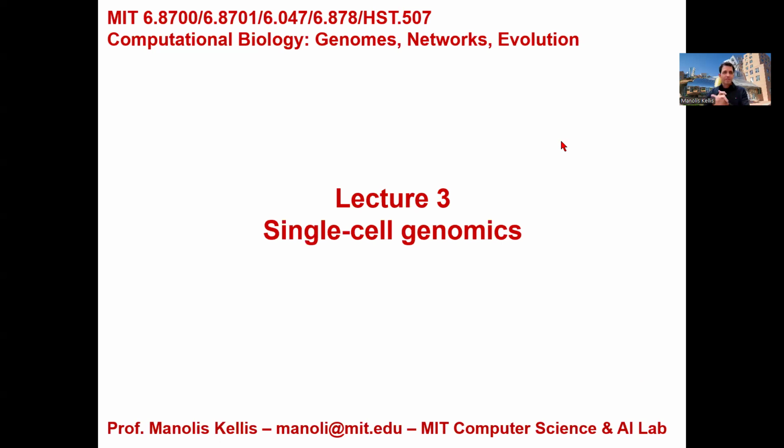All righty, welcome everyone. So today we're going to be talking about single-cell genomics. On Tuesday, we basically talked about gene expression analysis, and I told you there are a lot of complications with single-cell genomics, and we're going to talk about them in lecture 13. Well, guess what? We're going to talk about them today because your problem set has basically the entire pipeline of single-cell analysis, differential analysis, pathway enrichments, some single-cell epigenomics, all blended in an awesome Jupyter notebook.